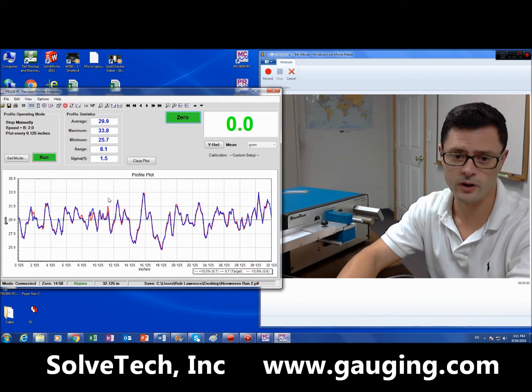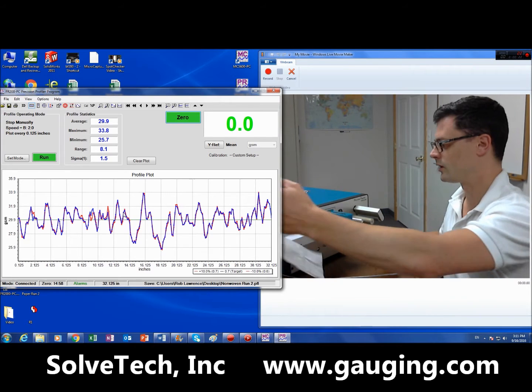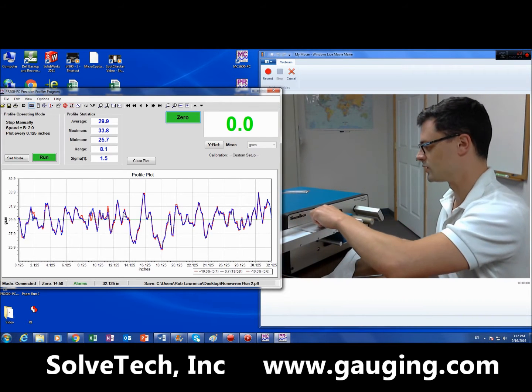You can see I've just done a run here, and there are two runs overlaid. I'm going to do this again, so you're going to see that this is going to match just basically perfectly.